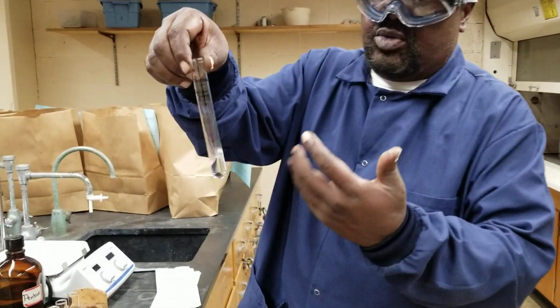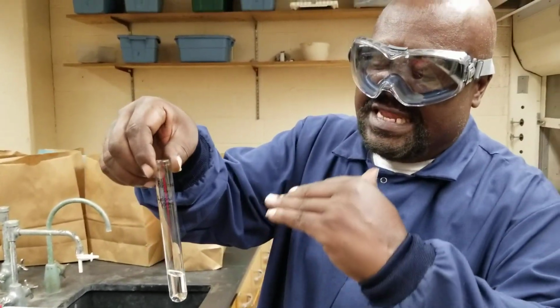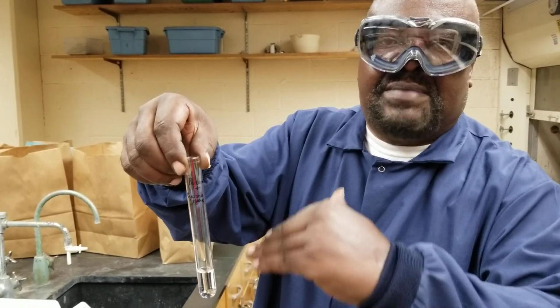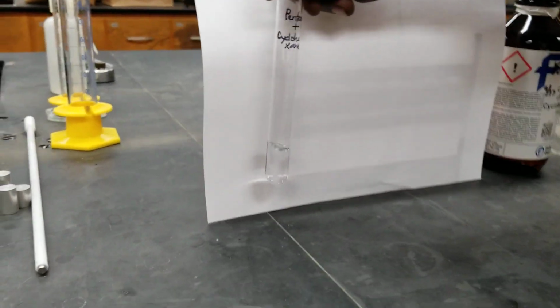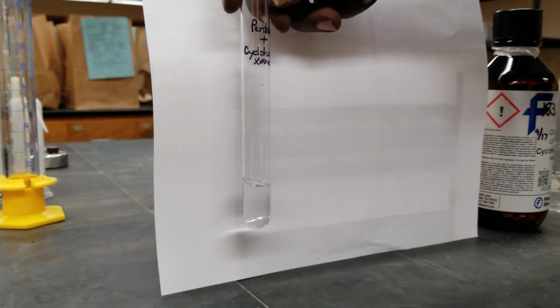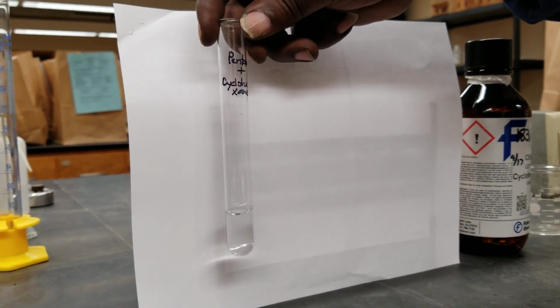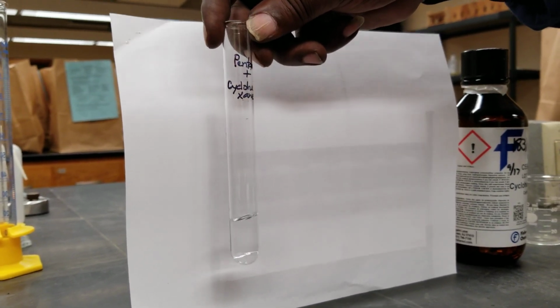In the case where we are looking at liquid to liquid, if they don't dissolve because they have different densities, they'll actually come out as different layers. And so in this case, I don't see any layers, do you? So this one kind of mixed nicely. Pentane and cyclohexane. All right, moving to the next one.